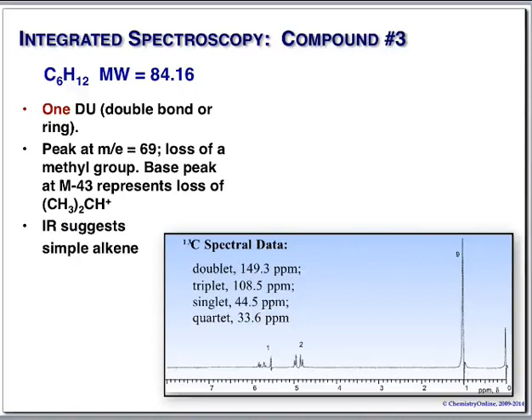Down here in the region 5 to 6, we have 2 multiplets, really. You could look at the multiplets and diagnose a splitting pattern, but we're not going to do that right now. This is worth a total of 3 hydrogens, and this is the region of the spectrum where we get absorbance from hydrogens attached to double bonds.